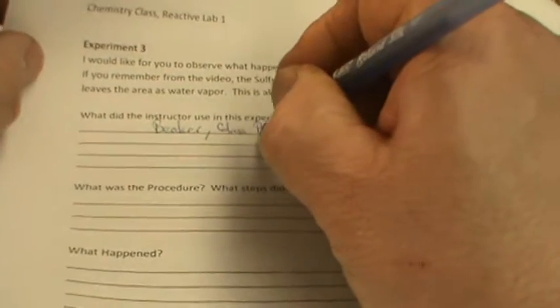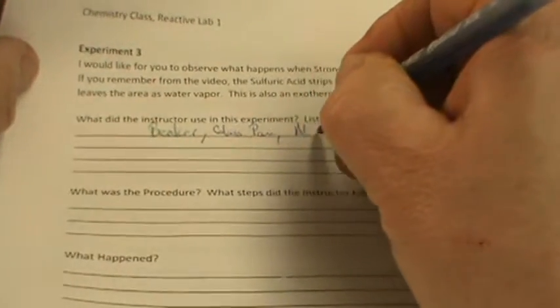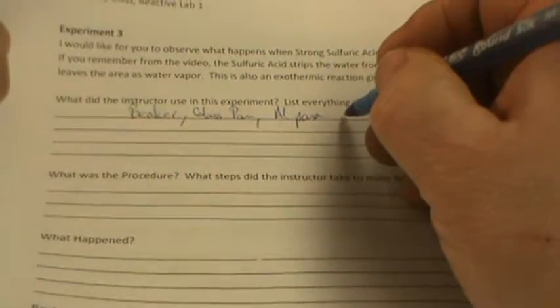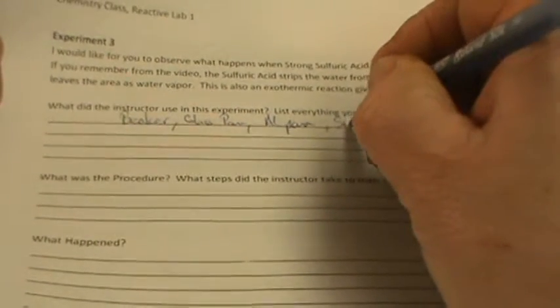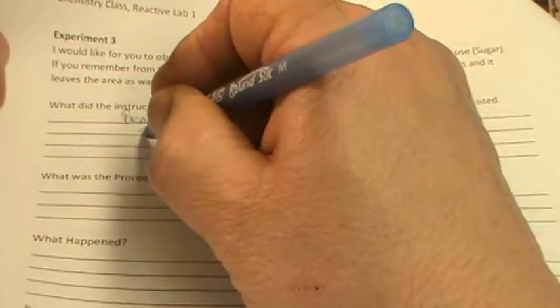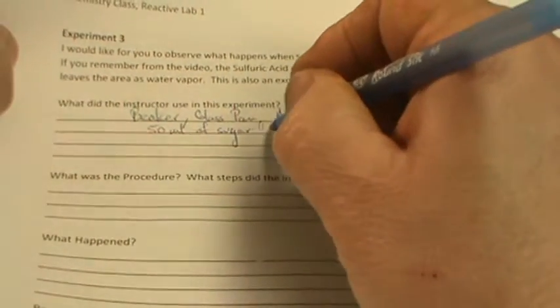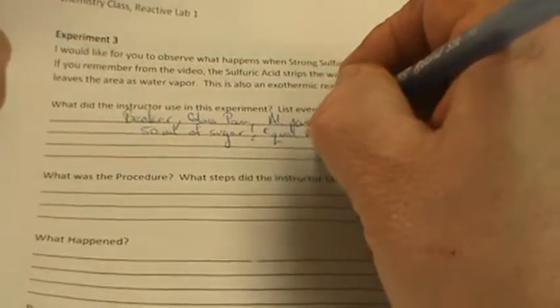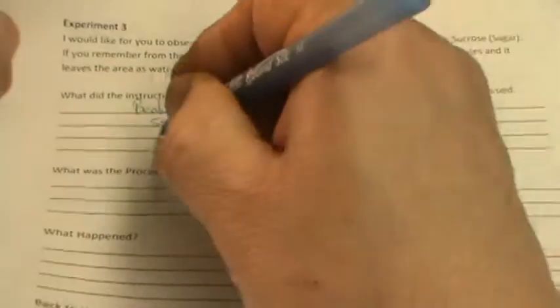We used a glass pan, an aluminum pan, Al is the symbol for aluminum. I had a stir rod. I used about 50 milliliters of sugar, that was the measure in the beaker, and I used an equal amount of acid, and then it was stirred.